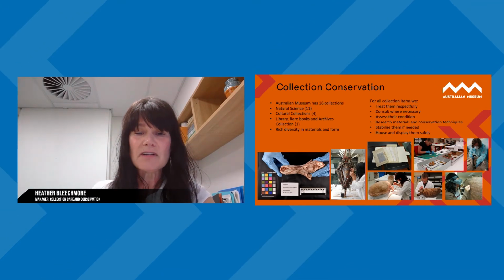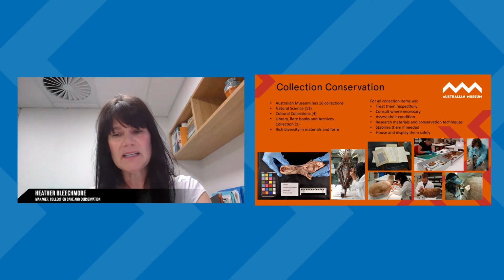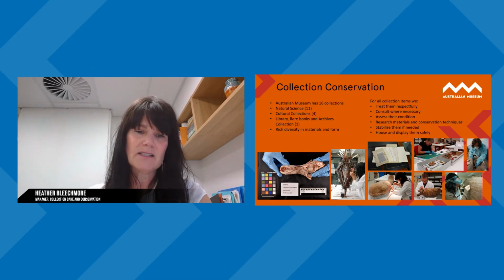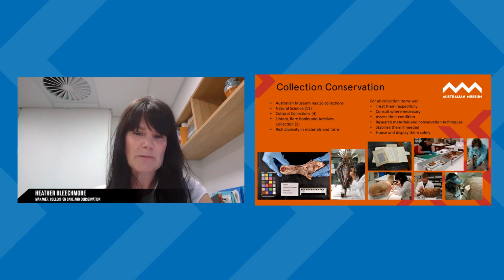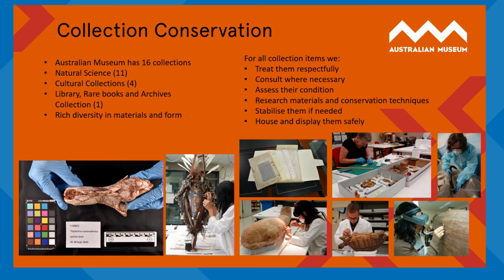Breaking down what we see in front of us into the materials that compose an object or specimen informs the choices that we make if it is necessary to introduce an adhesive, a consolidant, or a protective coating. In most cases, we'll consider the need to intervene at all, rather adhering to more of a minimum intervention approach. Hopefully the images in the slide can capture the range of materials that can be in the lab on a daily basis and give an idea of the documentation required. Essentially, conservators are working to understand these materials in order to preserve them for future generations.